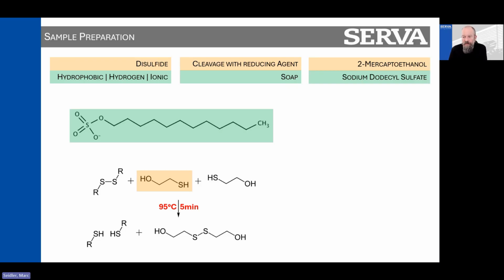And here we have the so-called proton exchange. You see, you have two mercaptoethanols that, when you just face them together, might have the same appearance as those two sulfides here. By cracking this and receiving two half-long pieces of your protein or your bond, the energy is much higher than with one long piece and two small particles.